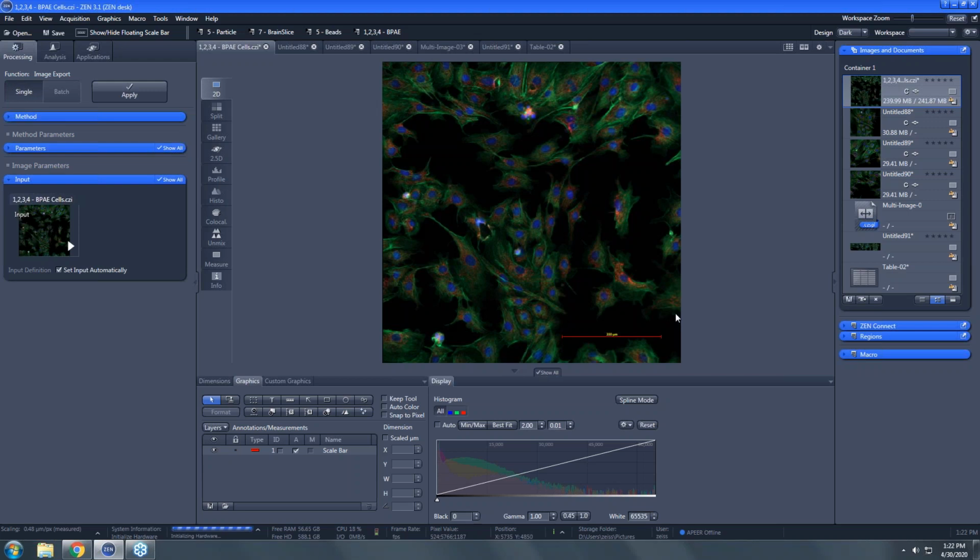Will the scale bar or any measurements that you add carry over to that image that we can create? I'm not sure what that means, the figure. Oh, yes, the annotations will carry into the figure. Sometimes the scaling doesn't look right and it can be a bit annoying. So it's a little bit finicky, and we won't go through showing that, but absolutely the annotations will show up in the figure maker. You can, of course, annotate the figure once you've created it as well, depending on what you want to put in.